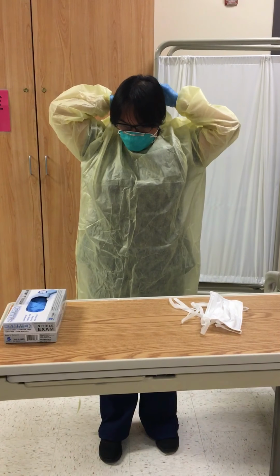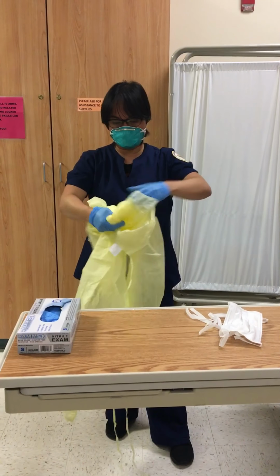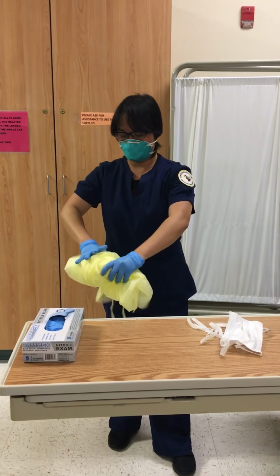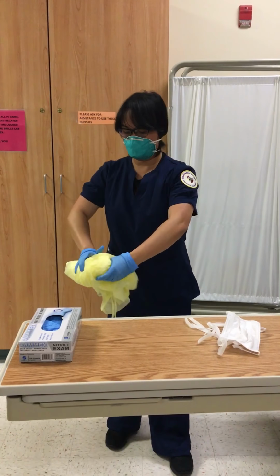Then you roll it away from you. And then you dispose of that in the biohazard bin.